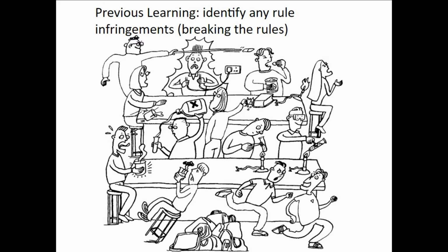You've got somebody eating in a science lab. You've got somebody sat down, facing the untied hair towards a Bunsen burner that's not very well placed. You've got, on the opposite side, somebody sat down during a practical, no goggles, knocking over a beaker full of chemicals probably. You've got somebody else reaching for a book that's got some broken glassware near it.